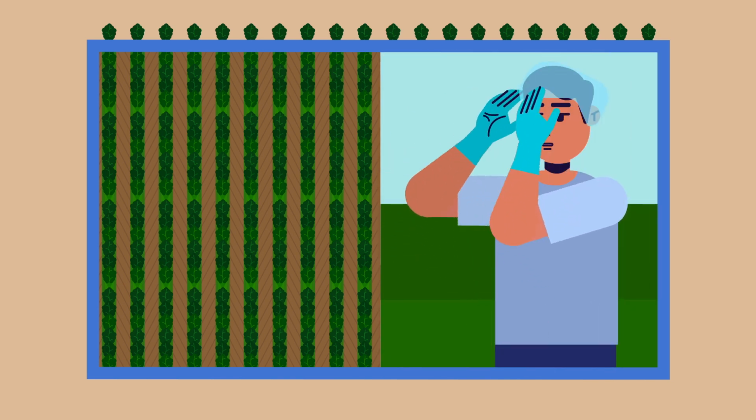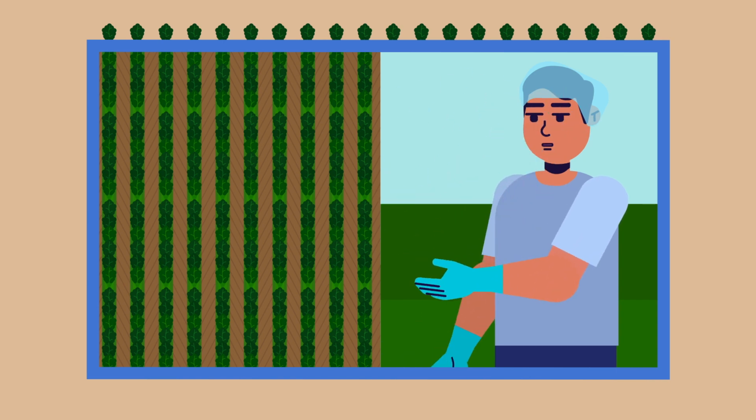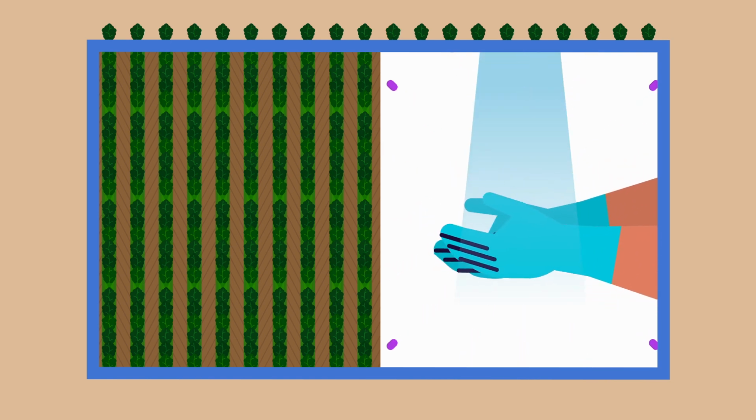Additionally, samples must be taken using an aseptic sample collection technique to prevent samples becoming contaminated during the sample procedure. The container should be a sterile sampling bag provided by the laboratory, of adequate size for the sample collection. The sampler must wear sterile gloves during the process and must sterilize them with alcohol.